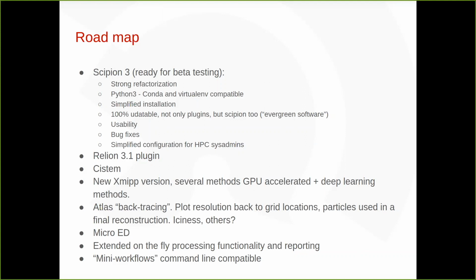And you might get some deep res stuff from Xmipp or whatever. This is flexible, so the plugin can decide those mini workflows. But it could be even called from the command line. So it would be a way to integrate Scipion mini workflows to the command line to run specific methods within the Scipion without the whole options that the Scipion already offers.